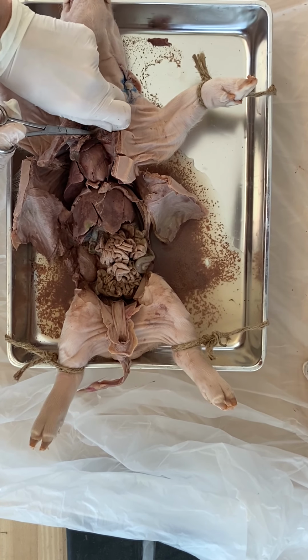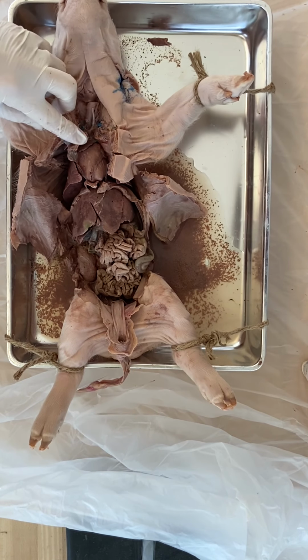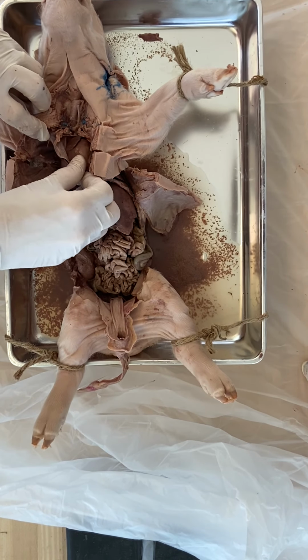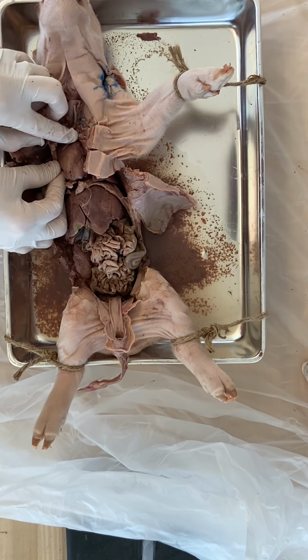You think that's the pulmonary vein? I do, because it's so thin. It's not the superior vena cava, is it? No, that's a really big blood vessel. That's much bigger than that. Okay. And I don't see it right now, but I've seen them before.